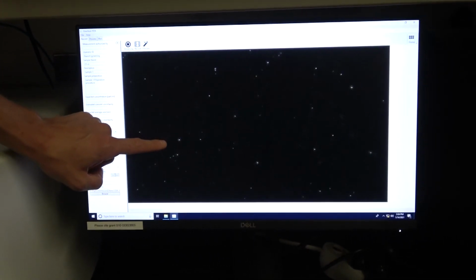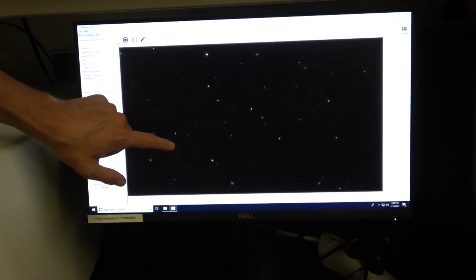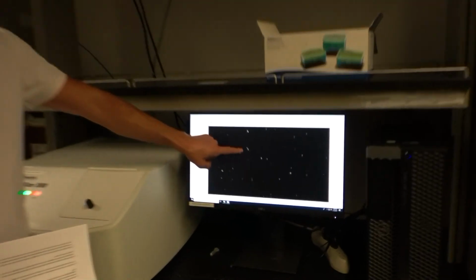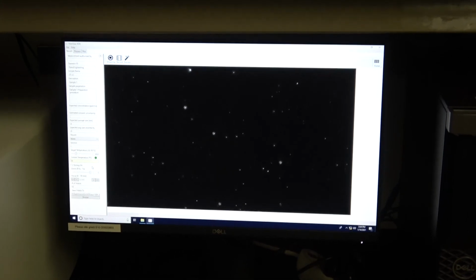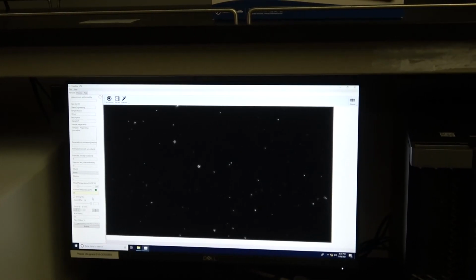As you look at the videos that we're going to give you for the 3 different sizes, I think you'll appreciate that the amount of movement of the bigger particles is going to be much lower. These particles are moving pretty rapidly. Based on the amount of movement, we're going to determine the size, and based on the number of spots of light, we're going to determine the concentration.